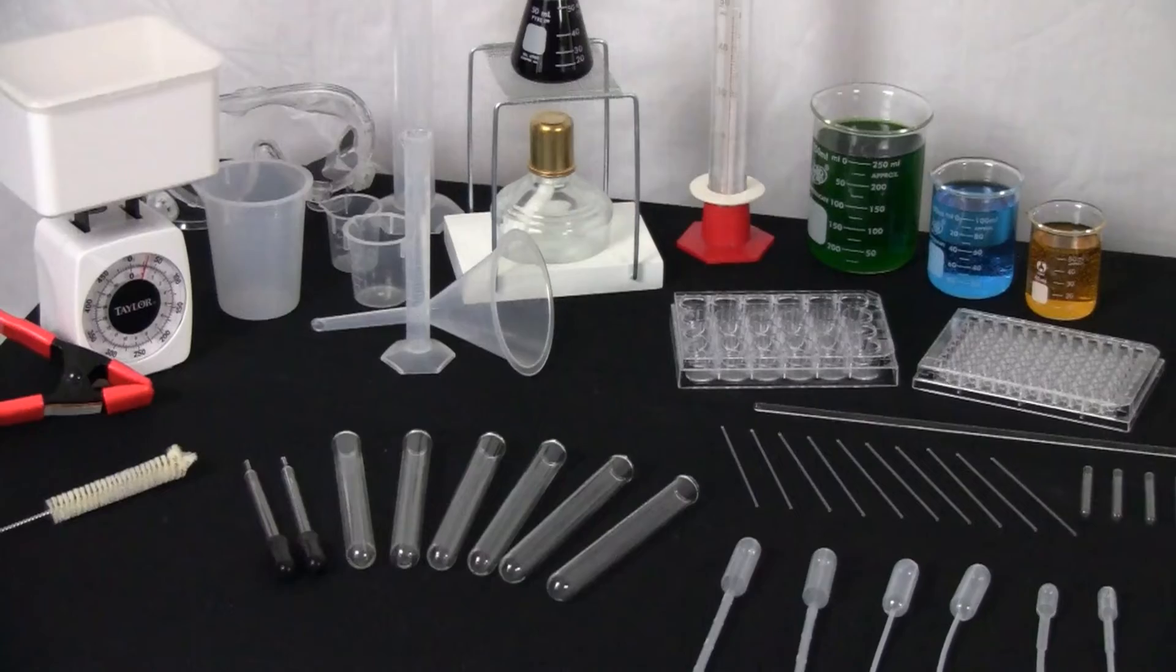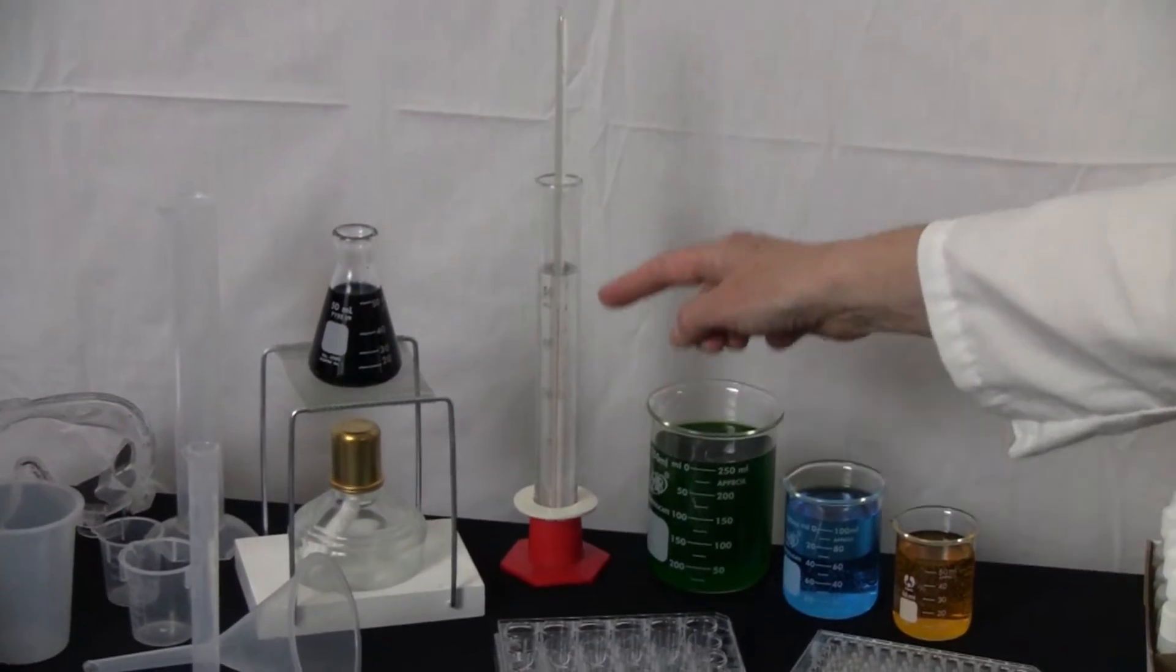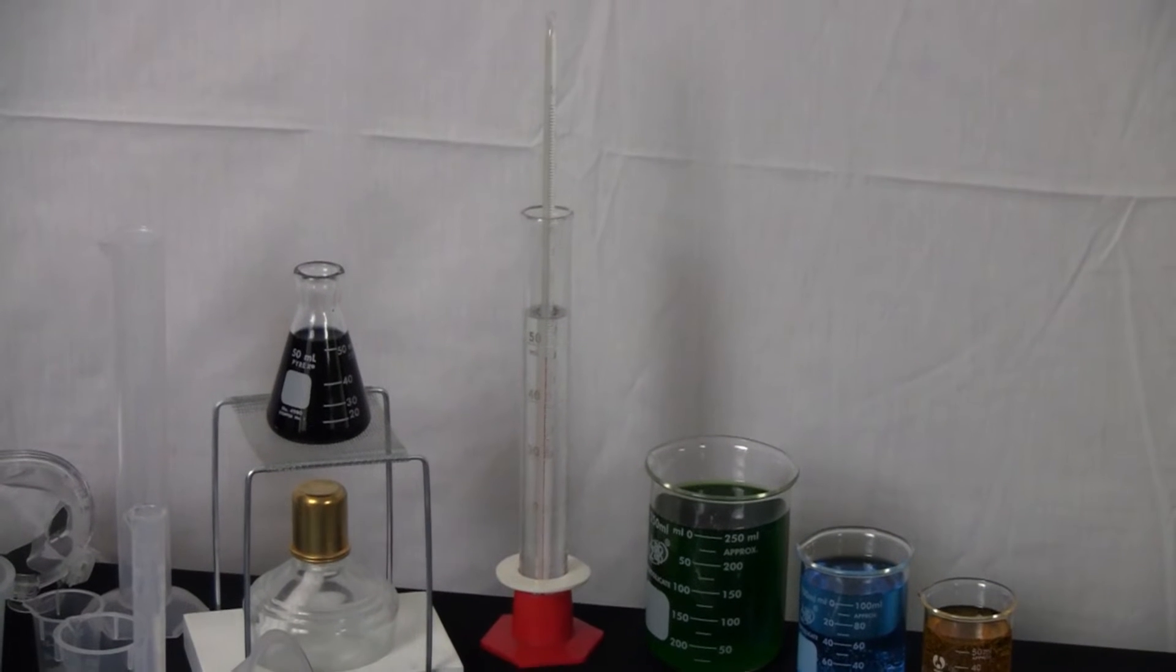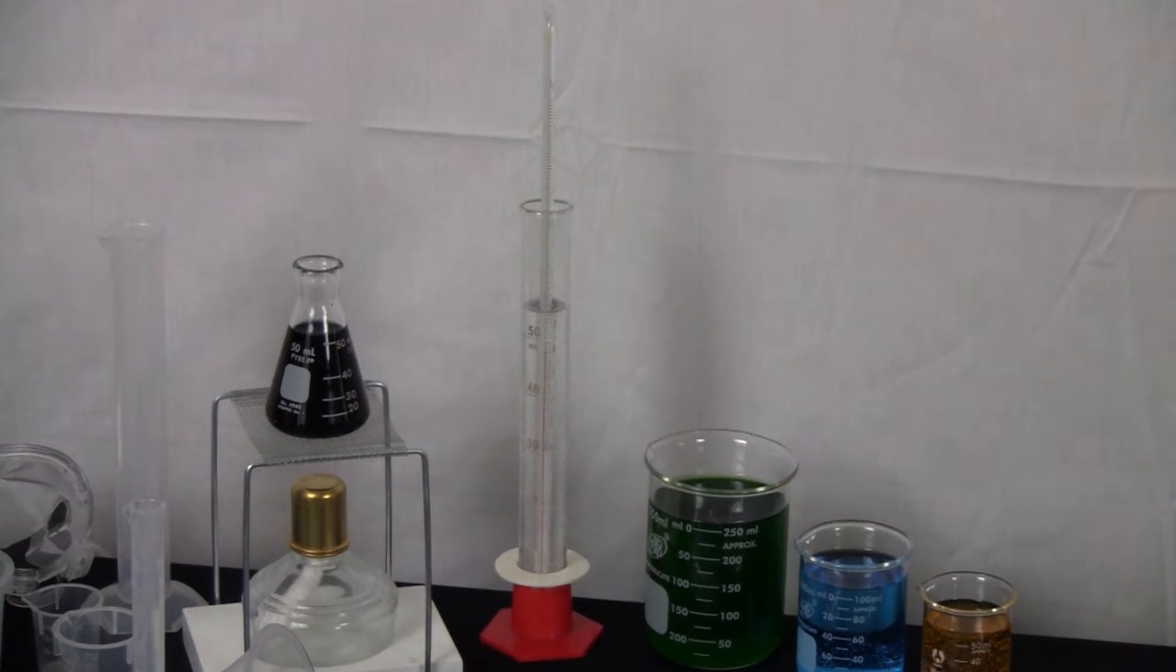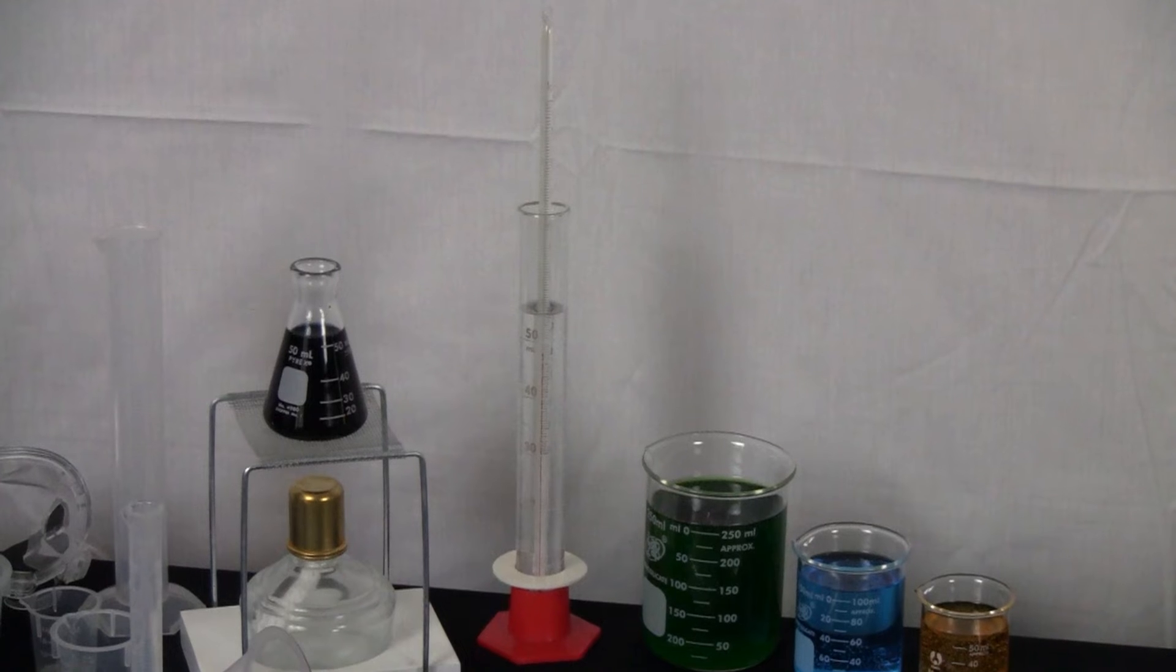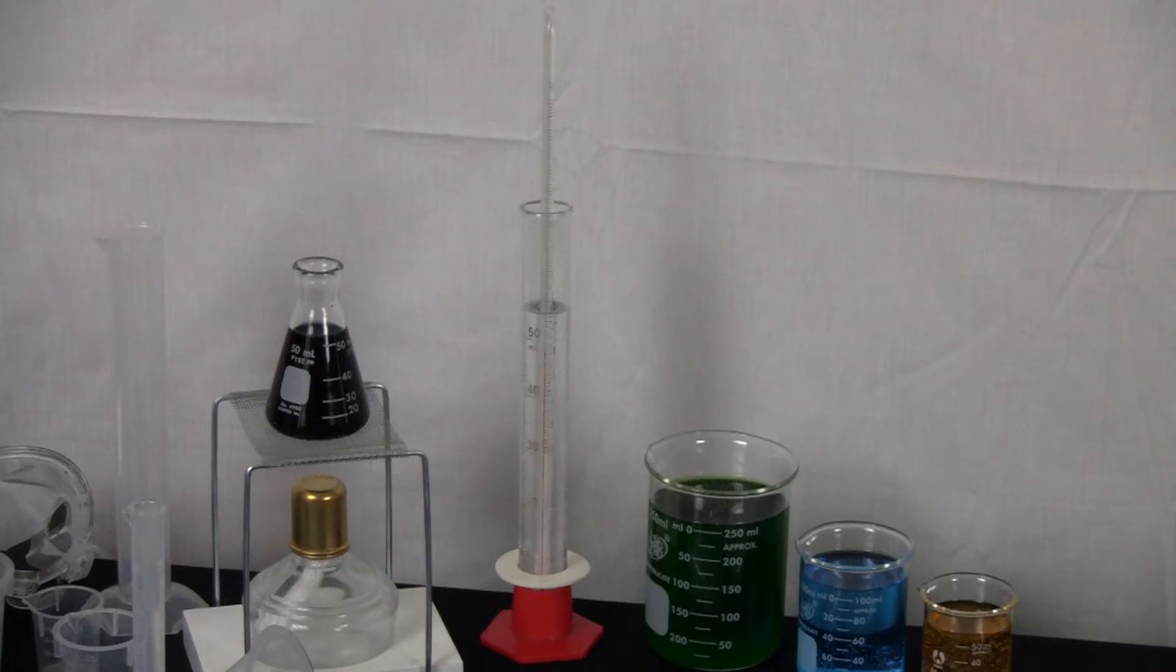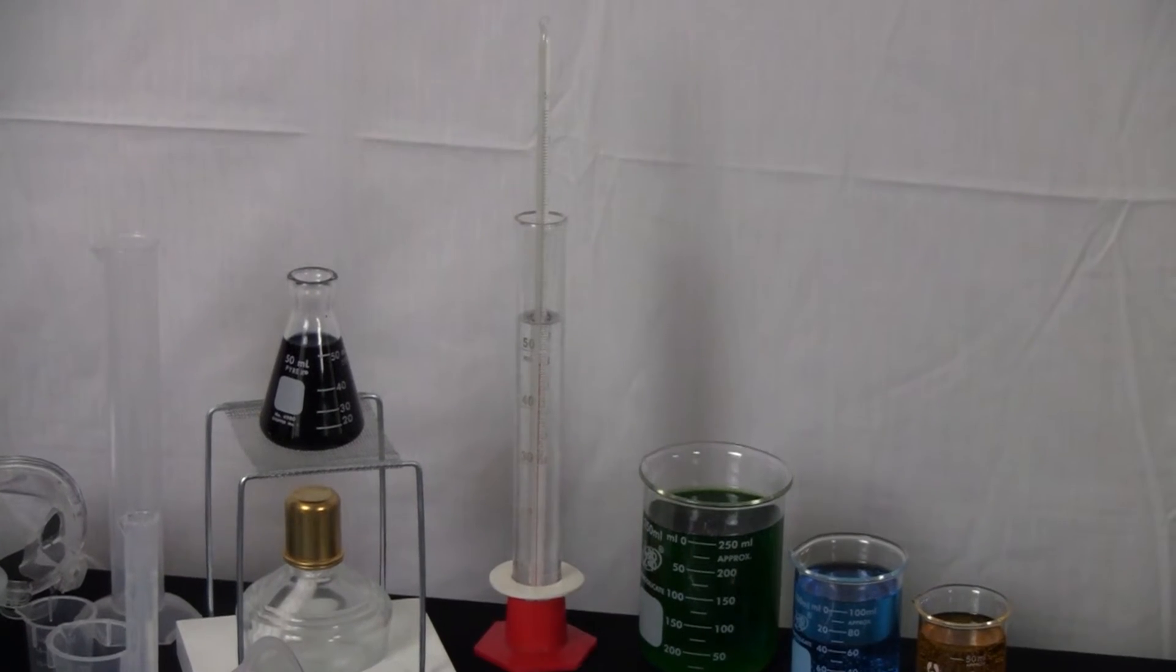Now we have graduated cylinders. This graduated cylinder right here is a long, thin cylinder, and it's similar to a measuring cup. It's more accurate on the sides. You have the different slashes to find out how much liquid you have in it. And so, this is used also for measuring liquids.